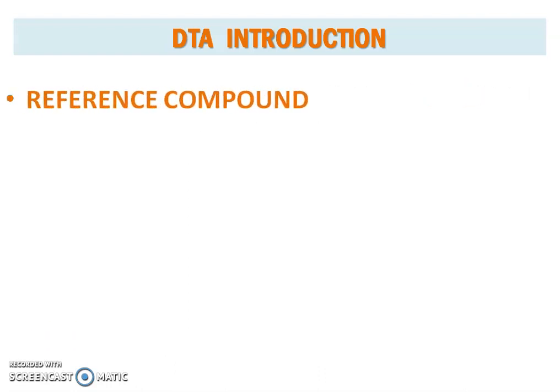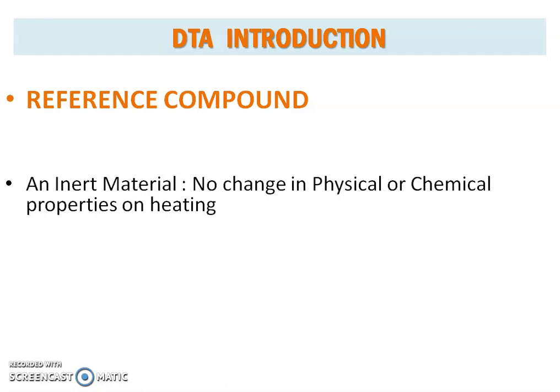Next up is the reference compound. The reference compound is an inert material, and as the name suggests, this material will not undergo any kind of physical or chemical change upon heating.